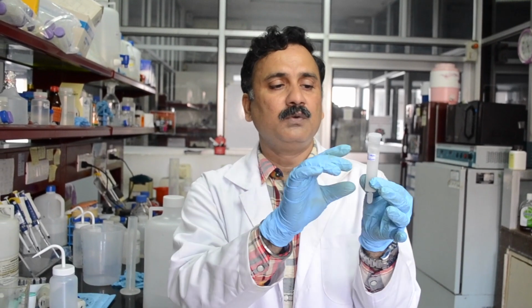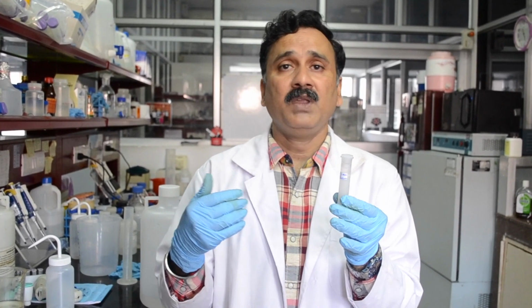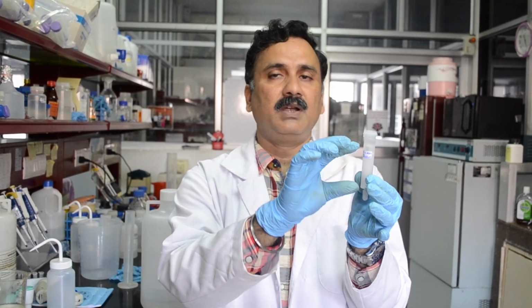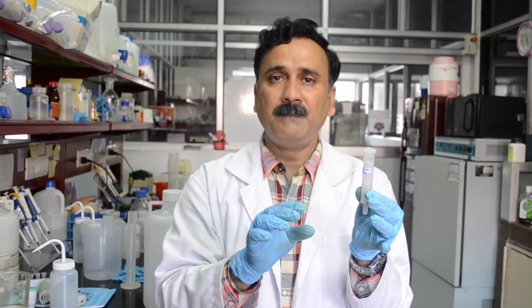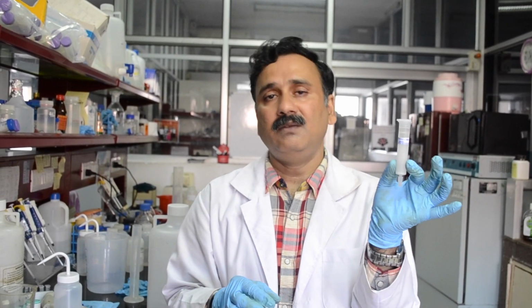Now first, we have to equilibrate this column with the solvent in which you are interested to do the buffer exchange. In this case, we are trying to desalt the protein, so we are going to equilibrate this column with water, and then we are going to load the protein into this column and start collecting the fractions, and that is how it is going to remove the salt from the protein.